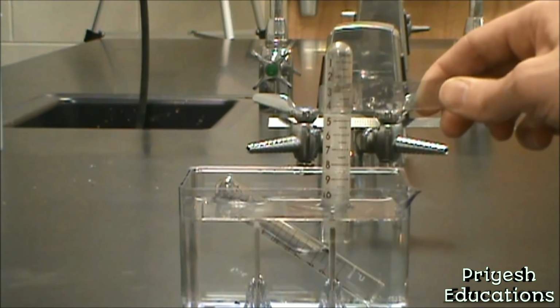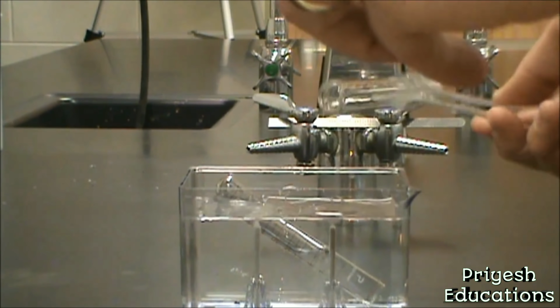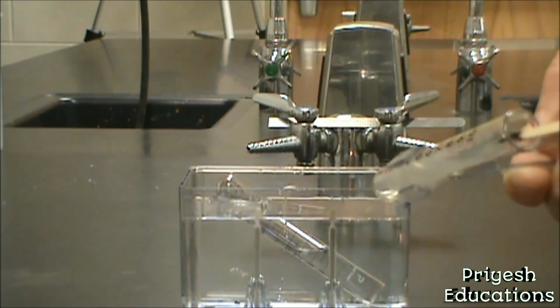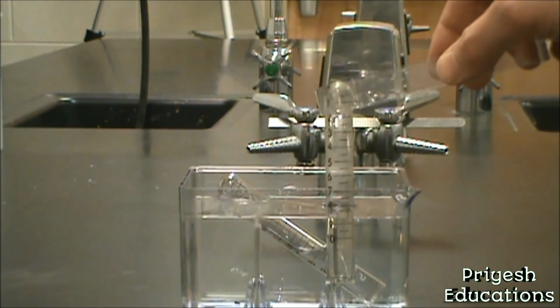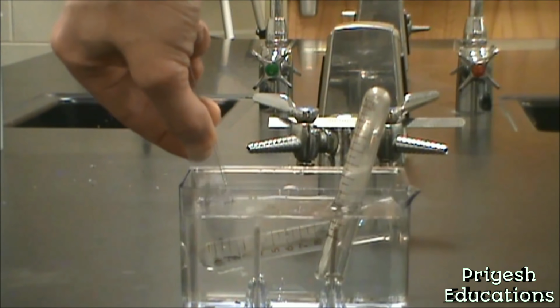The splint is ready. We're going to put that flaming splint into there. And we can see that that lit back up, which is indicative that we have oxygen gas present. So what we ended up with was 3.8 milliliters of oxygen gas and 7.6 milliliters of hydrogen gas.